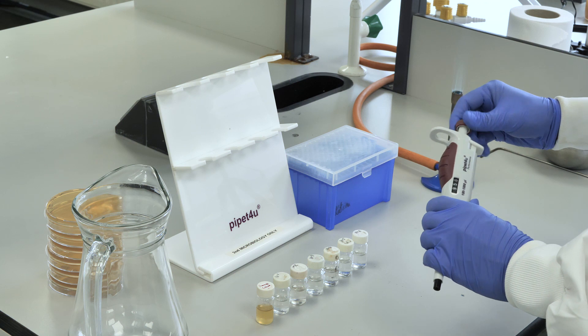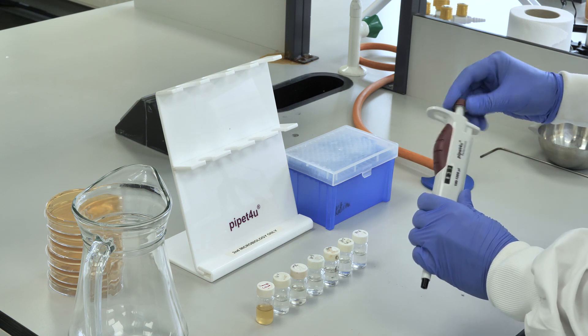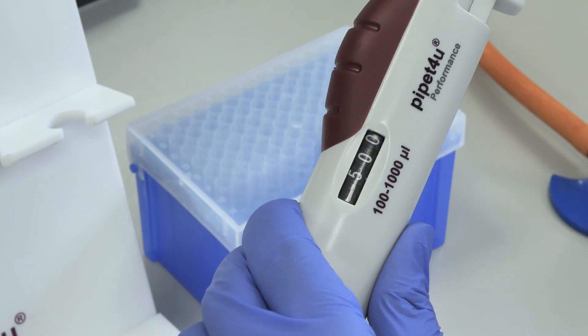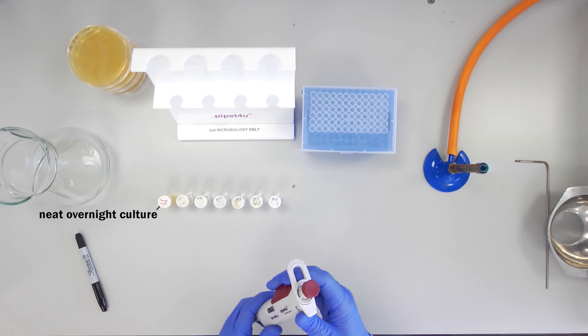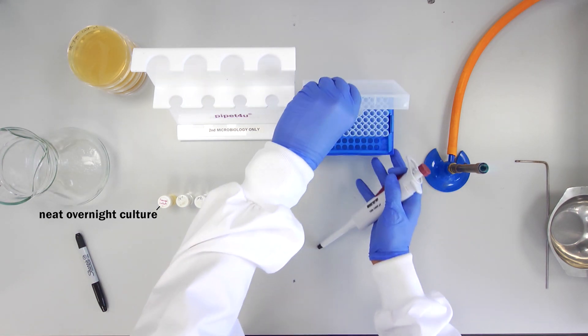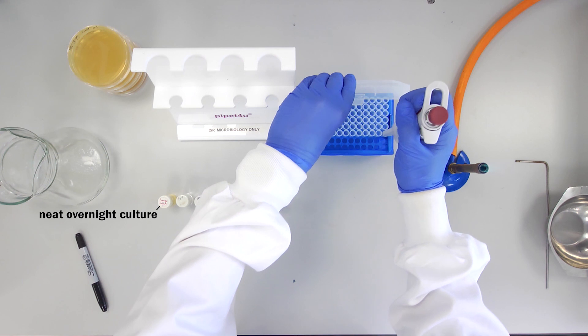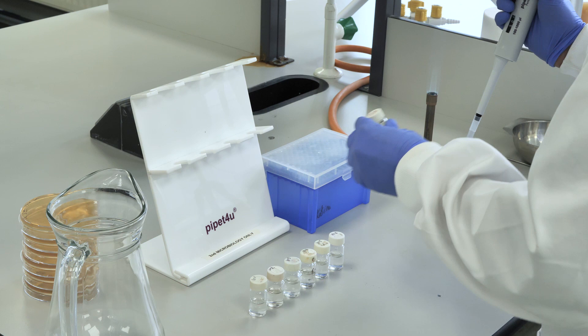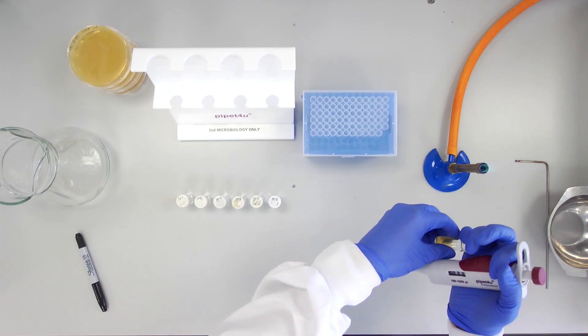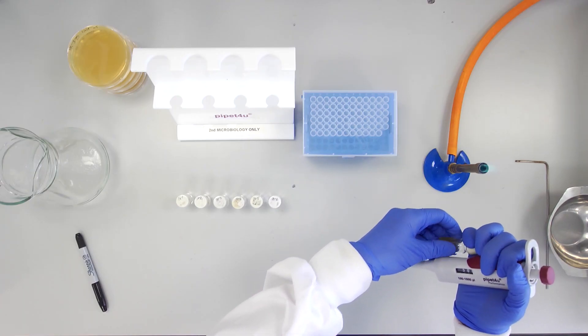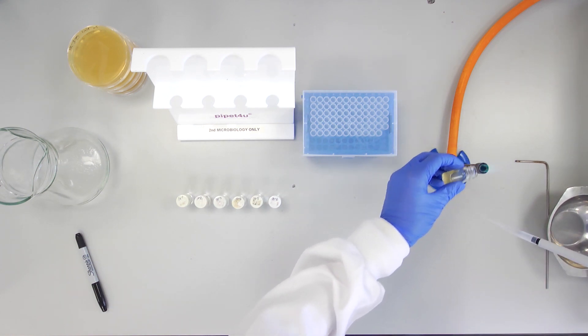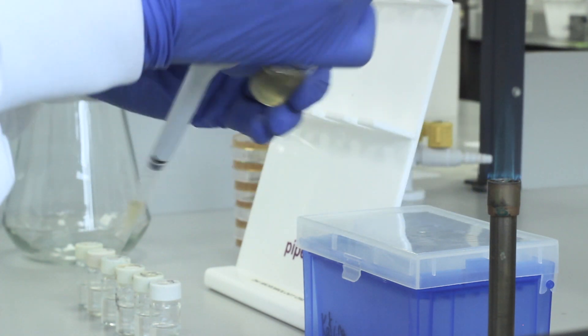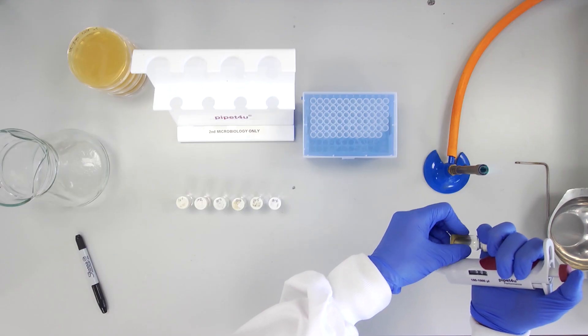Using a pipette with a fresh tip attached, remove 500 µl of the overnight culture. Take the overnight culture, mix the culture suspension well, flaming the open neck of the bijoux before and after removing the liquid. Note that the tip box is only open while the tip is being removed.